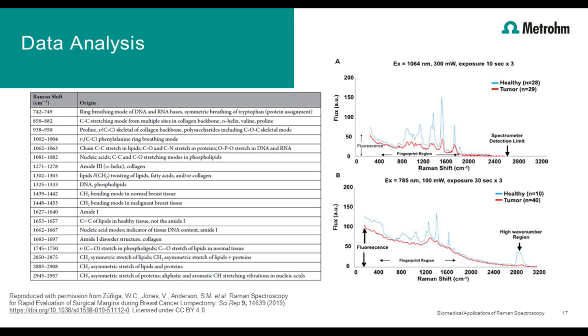That's why we have to use chemometric analysis here to help us parse out those very slight differences between the healthy tissue and the cancer tissue.